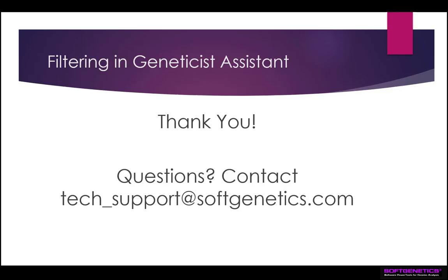Thank you for viewing this webinar on filtering in Geneticist Assistant. We've discussed setting up filter parameters, saving the filters to a template, and a few options for applying the filters.